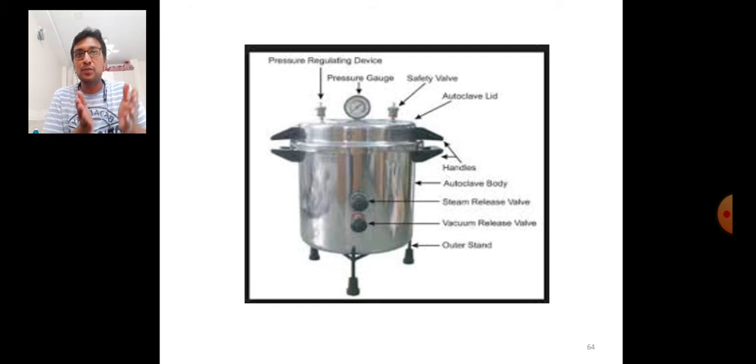जेव्हा वाफ तयार व्हायला सुरुवात होते ऑटोक्लेवच्या मध्ये, तर वाफ तयार होते आणि मध्ये एक प्रेशर तयार होतोय. तो मध्ये किती प्रेशर तयार झाला आहे हे आपल्याला कशावरनं करणार आहे. जो प्रेशर गॉज या फिगरमध्ये दाखवलेला आहे सेंटरमध्ये बघा तुम्ही, at the top side of the closing lid in the center portion there is the pressure gauge. On the left hand side there is one valve, on the right hand side there is another valve. Okay, so student, try to understand.